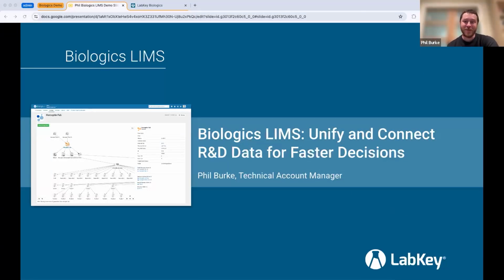And today I'm going to be talking to you all about the Biologics LIMS suite that LabKey has. We'll be talking about unifying and connecting your R&D data for making faster decisions throughout the biologics development process.